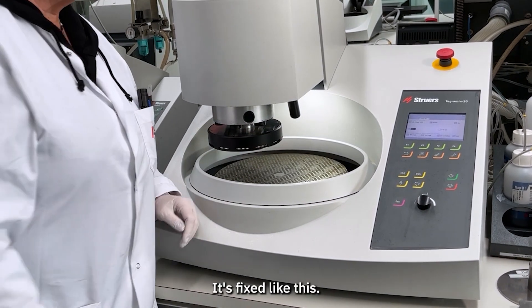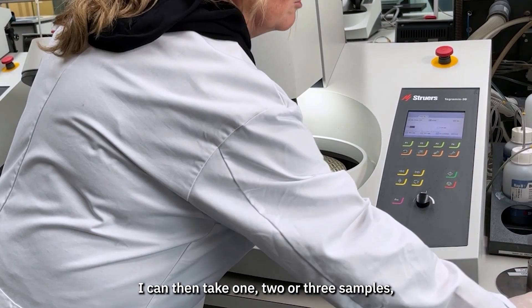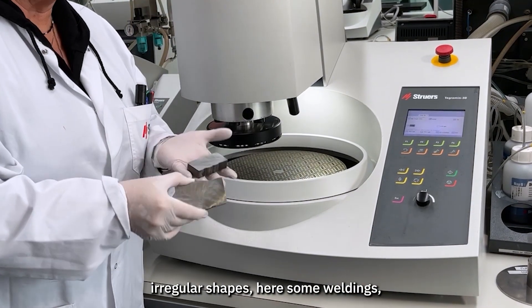It's fixed like this. I can then take one, two, or three samples of irregular shape.